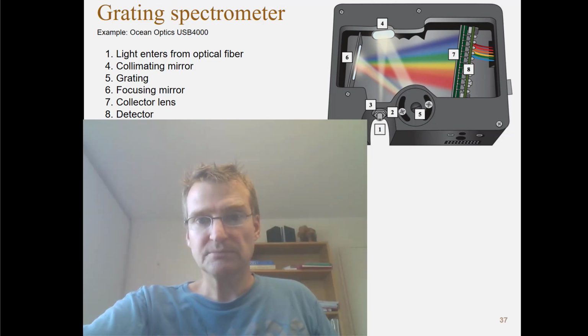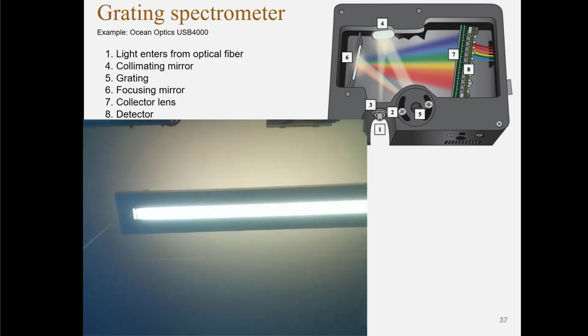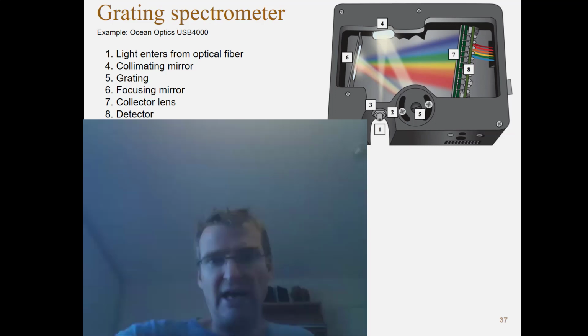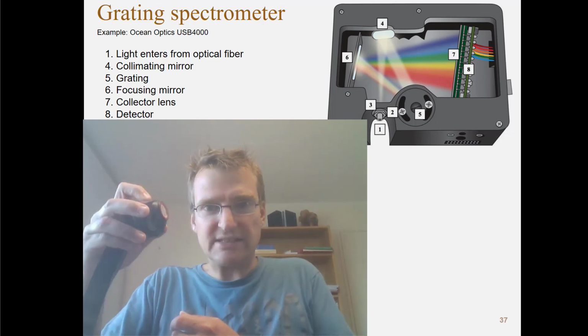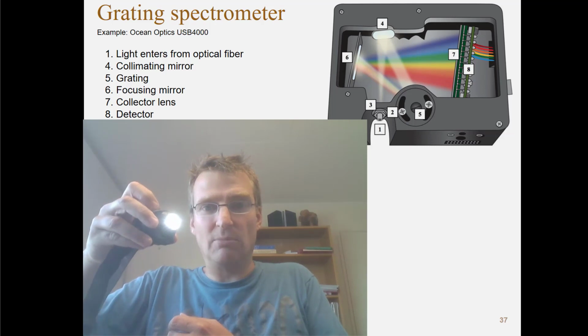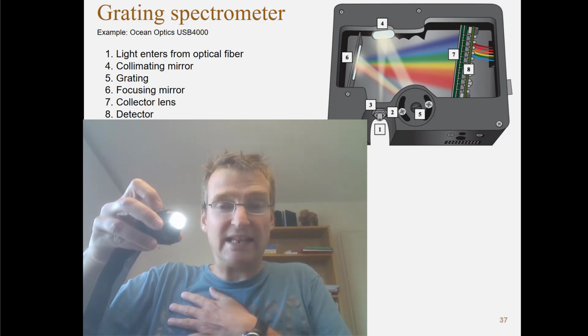Okay. So above me I have a fluorescent tube. I will just fold it back like this so that you can see it. It's just a classical fluorescent tube. And I will also analyze the light from one of these. I will turn it on here so you can see it. It's one of these normal headlights, and inside it is a white LED.